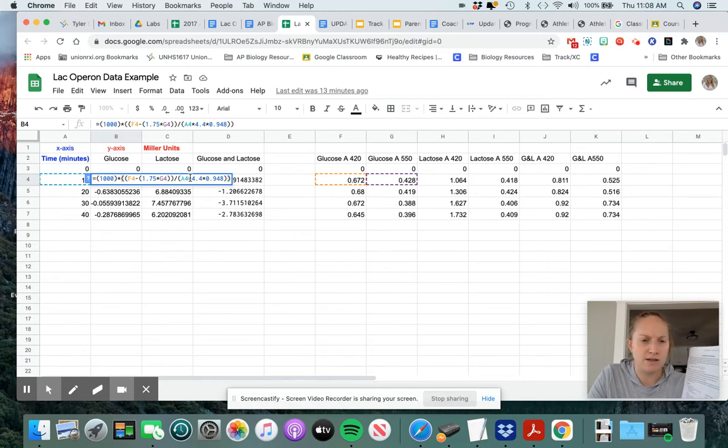So this means basically for this time component 10 times, and then it has the next number, 4.4. That should be your total volume in each tube. Where I got that number from, 4.4 is just the total volume.